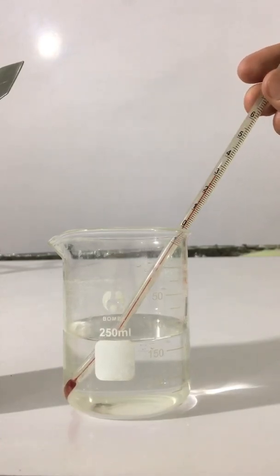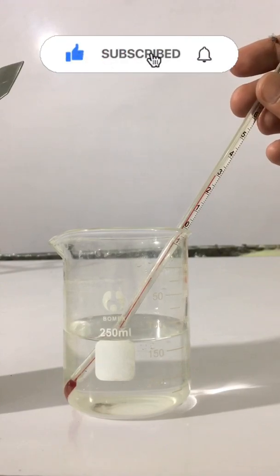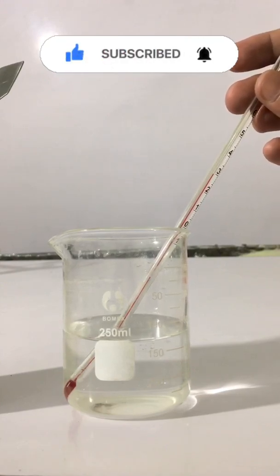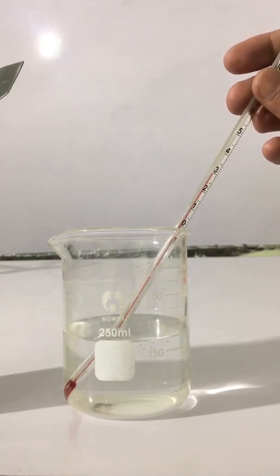First of all you have to dip the thermometer in water and you will notice the temperature of water. You can see that the temperature of water is about 29 degrees centigrade.